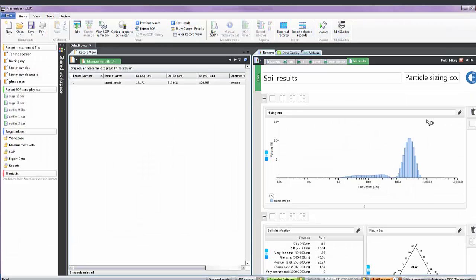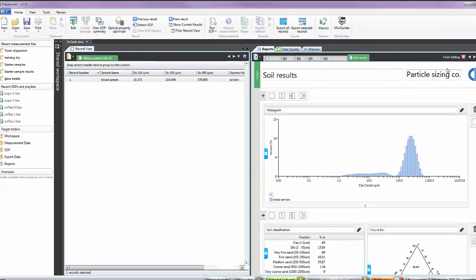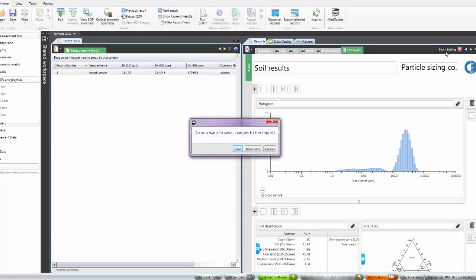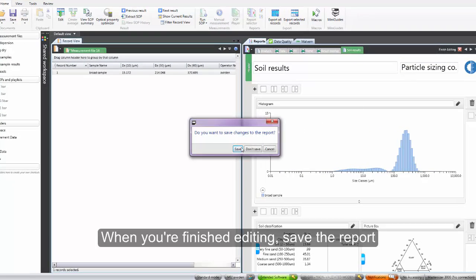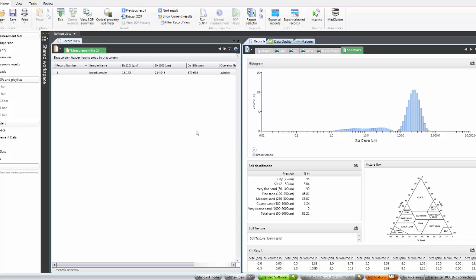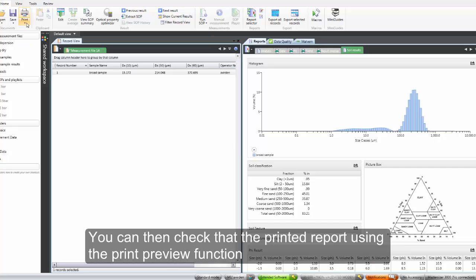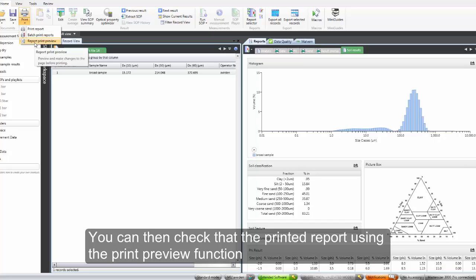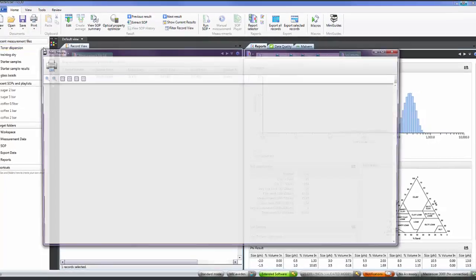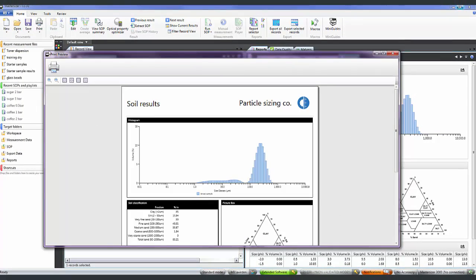And when I am happy with the report I can click on finish editing, save the changes to the report. And you can also use the print preview function to make sure that the printed report looks the way you want it to as well.